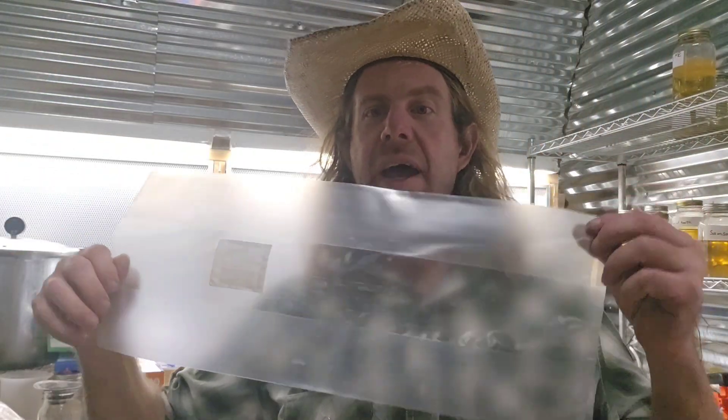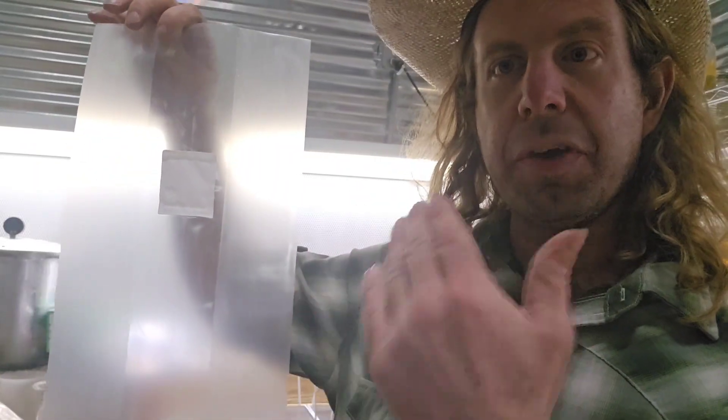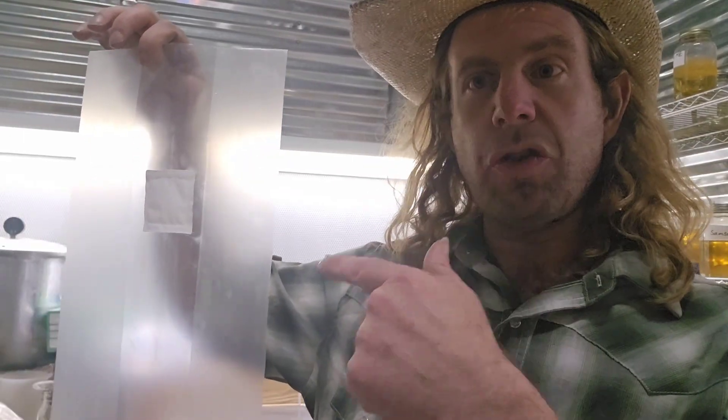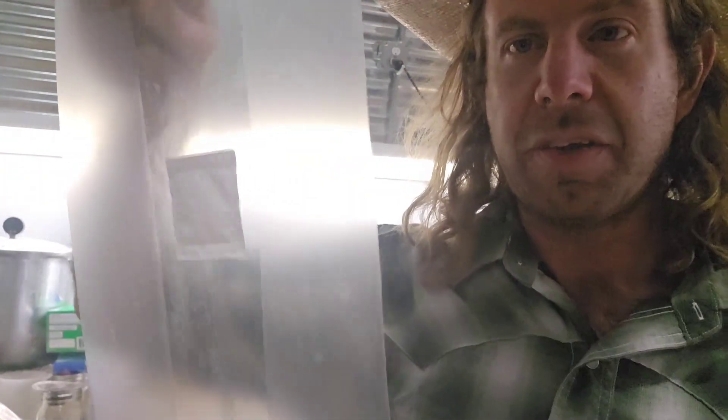Number twenty-five: spawn bags. These are Unicorn bags — specifically a 3T with a 0.2 micron filter patch. When you're making your best no-prep grain spawn recipe, you're going to want to pick up some of these 0.2 micron filter patch spawn bags. Number twenty-five: spawn bags.